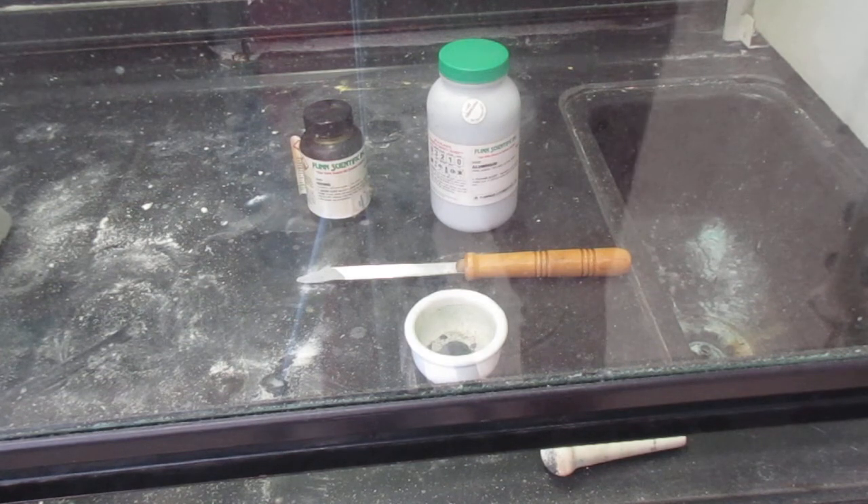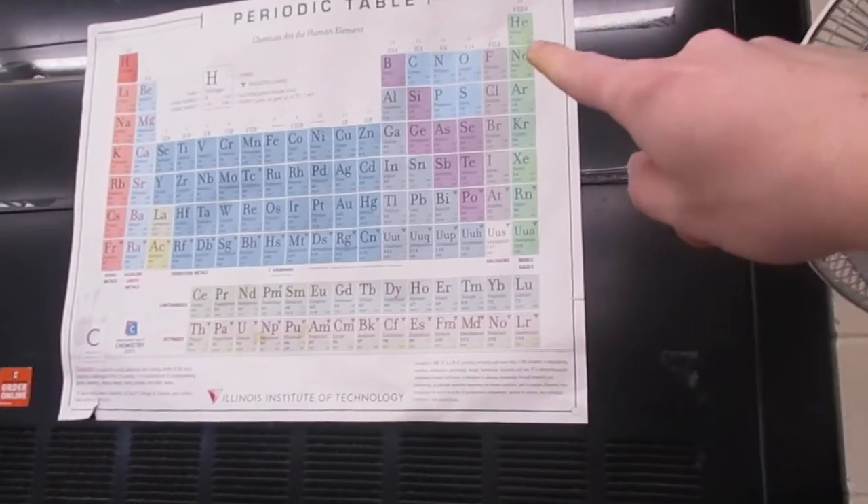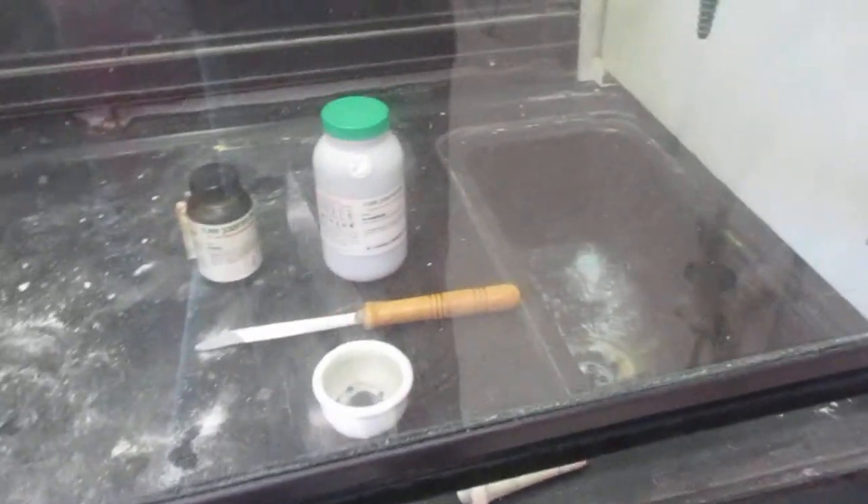This is called the purple haze demonstration, and it gives us a rare chance to actually look at and talk about how reactive halogens are. Right now we have crushed iodine.